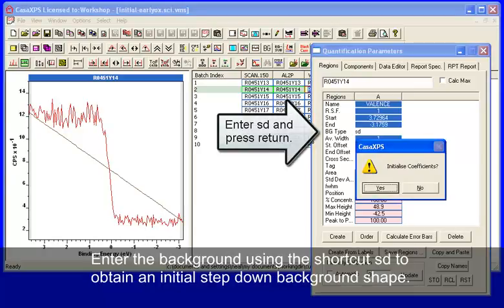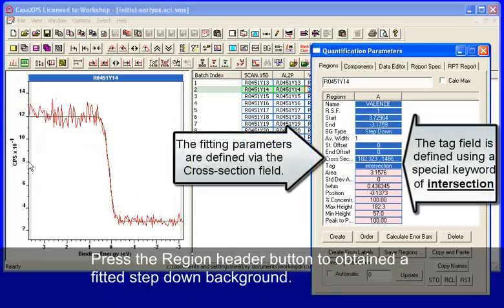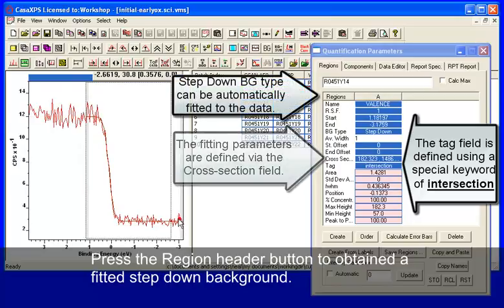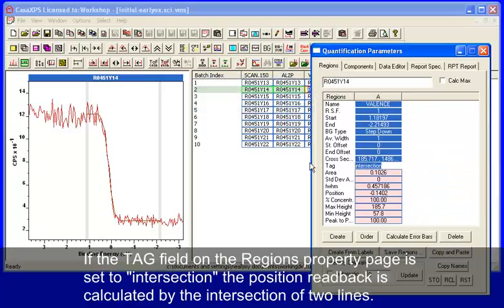The other one is based on calculating a horizontal line as part of the step function, and we can see these two lines if we enter draw lines in the tag field.